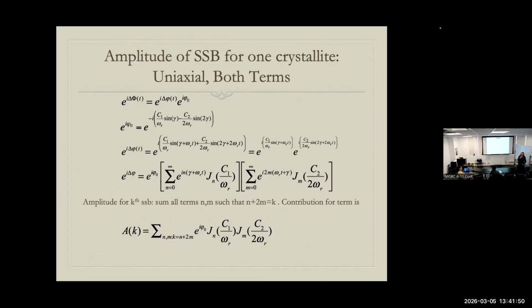What you estimate as the dipole coupling can look very different on the first spinning sideband and the center band. Is that an artifact? Is that information? It comes out of not thinking about the average, but thinking about the orientation dependence explicitly. So I have a tendency, especially in a class, to just leave it at that. Even if we could do an integral, it might be throwing away the baby with the bathwater a little bit.